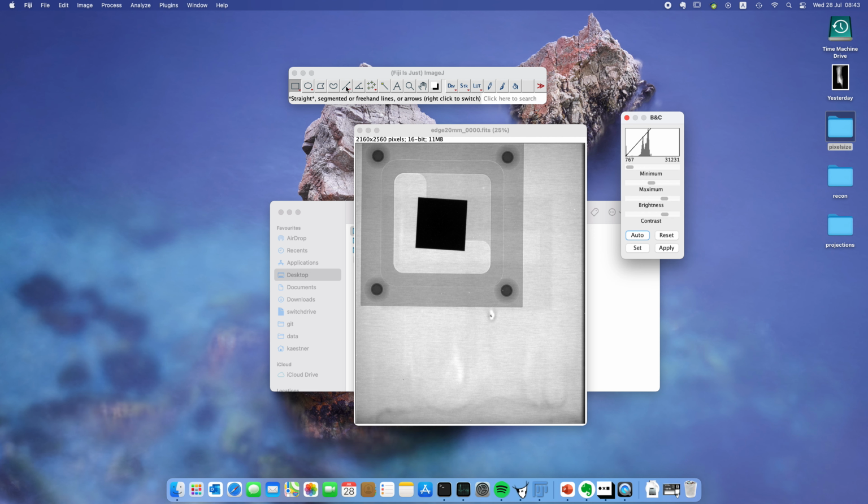Then the next thing you have to do is take the line measurement tool, try to find a good spot and drag this line to the other side. Well, that's not really perfect, so let's go, yeah, maybe something like this. Now we have the length of this object.